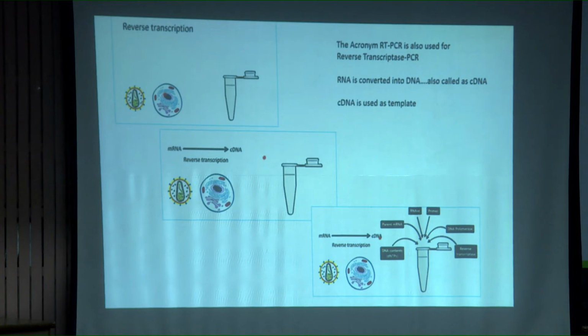During the developmental transition from one stage to another stage, you harvest RNAs. Okay? Eliminate all other RNA, keep only the messenger RNA, and the messenger RNA becomes your template here, right? So the question here is, we cannot amplify this messenger RNA, we need to convert it into a DNA. That is done with the help of a small intervention, what is called reverse transcriptase. So you convert the RNA into DNA, and this DNA is called cDNA. It is complementary DNA, right?